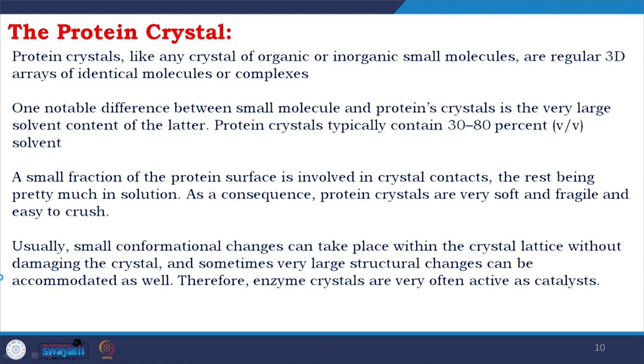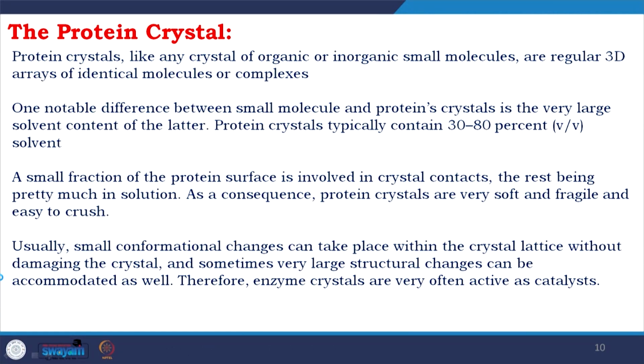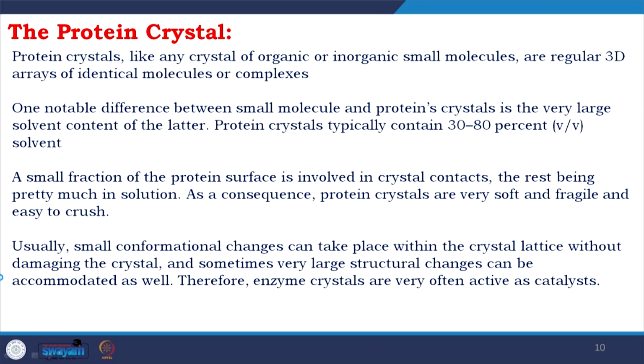Usually, small conformational changes can take place within the crystal lattice without damaging the crystal. So, when you have a crystal of a protein, if you add a small molecule or another protein that goes in and forms the crystal, small conformational changes are observed, but there might also be very large structural changes, which have been seen in many cases on adding a small molecule or protein molecule, and mainly small molecules. Therefore, enzyme crystals are very often active as catalysts.